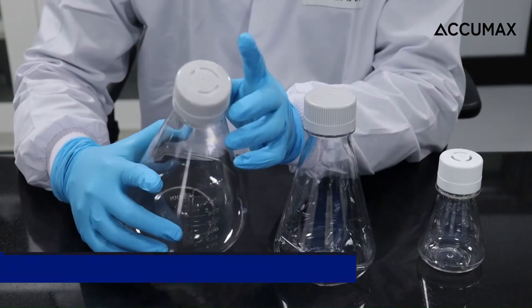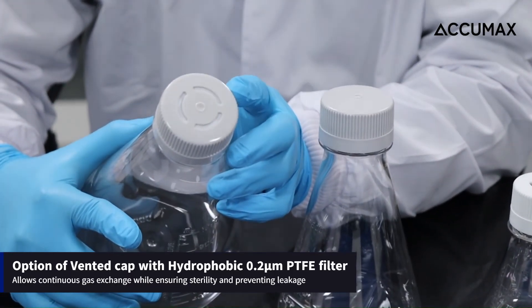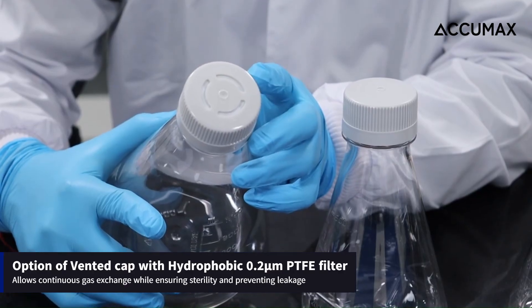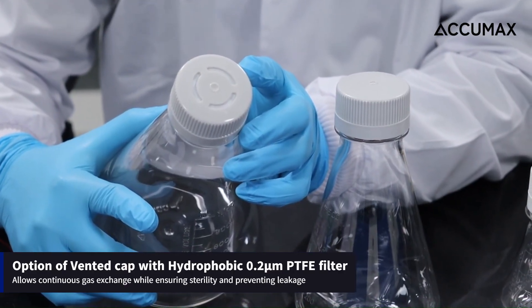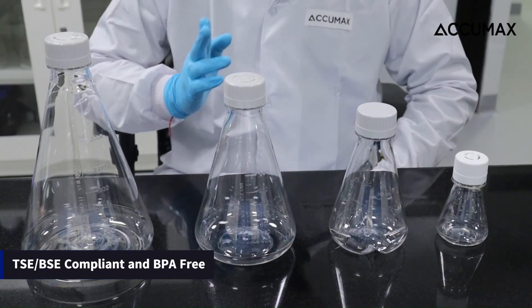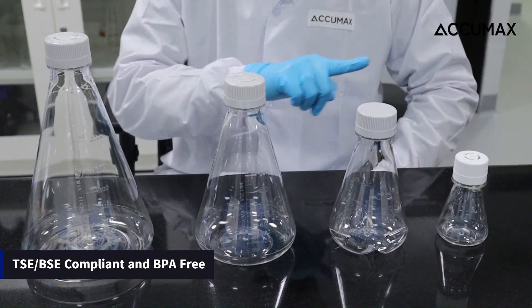The option of a vented cap with a hydrophobic 0.2 micron PTFE filter facilitates continuous gas exchange while ensuring sterility and preventing leakage. These flasks are TSE/BSE compliant and BPA free.